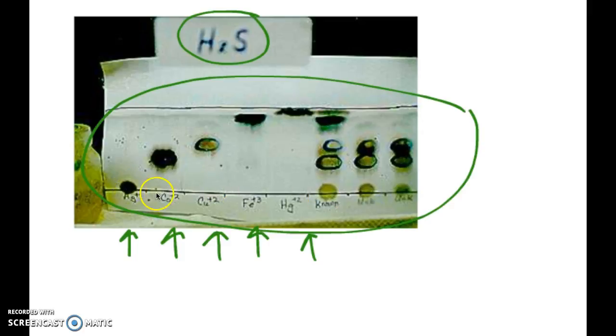The distance would be from the beginning, the starting line is marked here, to the center of each spot. And then you're going to have to calculate your RF, which is dividing that distance by the distance from the beginning to the distance of the solvent.